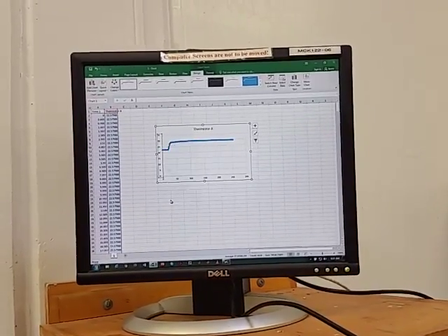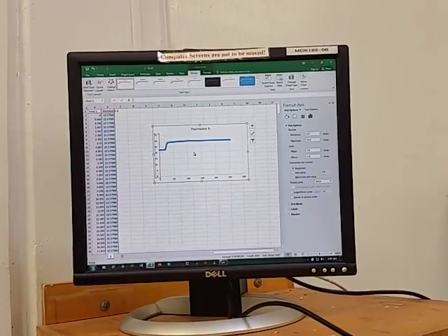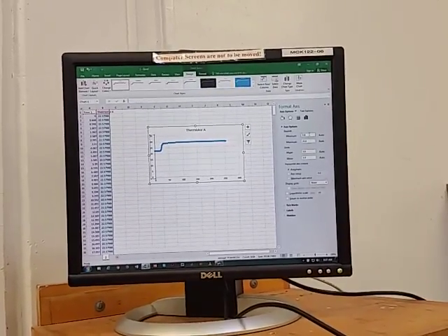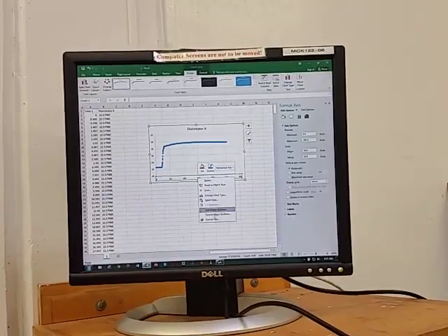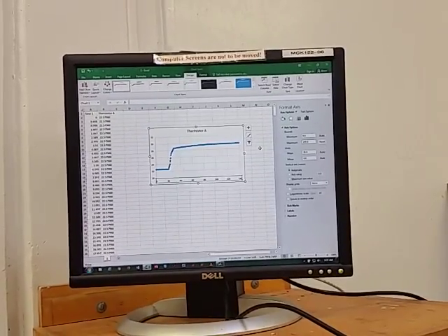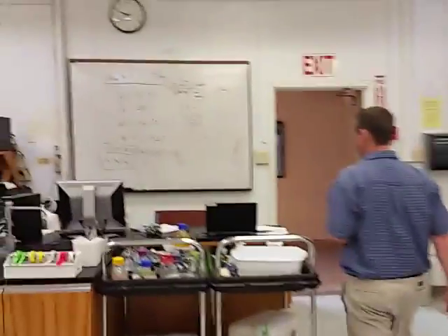I can also right-click here and format that axis so that instead of having so much of a figure for just a small portion of the data, I can adjust the axis so that the low range is maybe a 20 to start off with. That make sense? And I really don't need past 125, so I could even adjust this axis to go just as high as 140, like that. Okay? So that's another thing you're going to be able to do to export your data. All right? Good. That's a good place to stop. We'll stop.